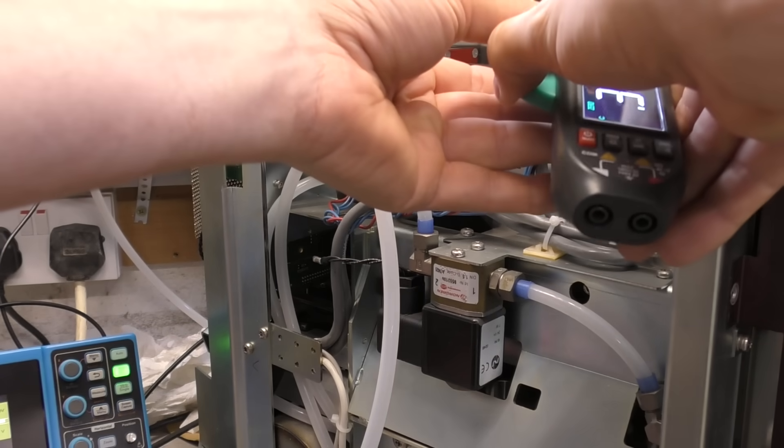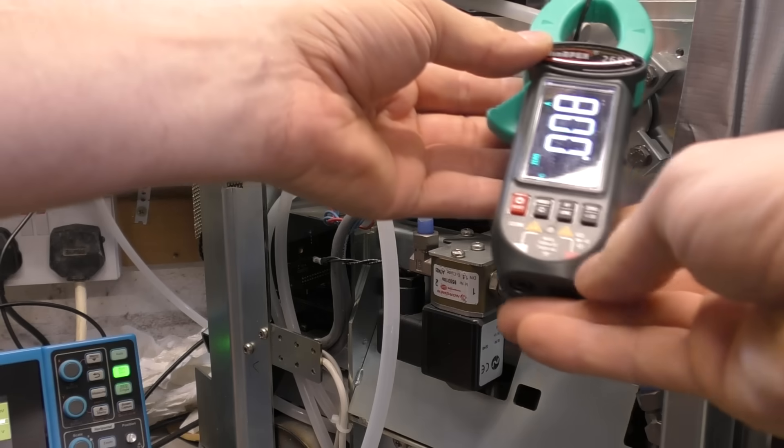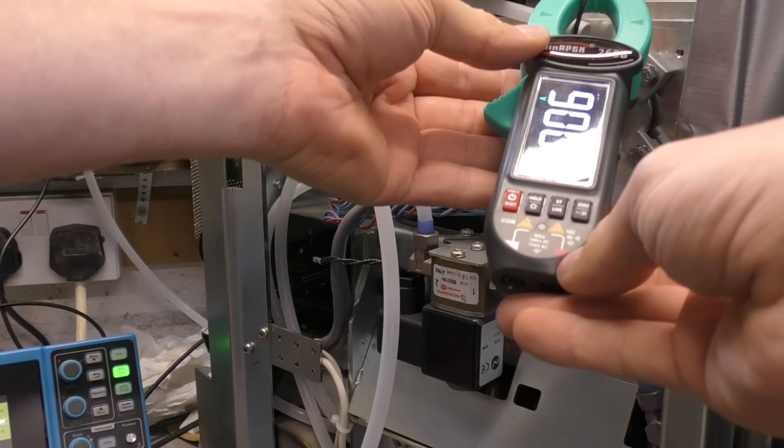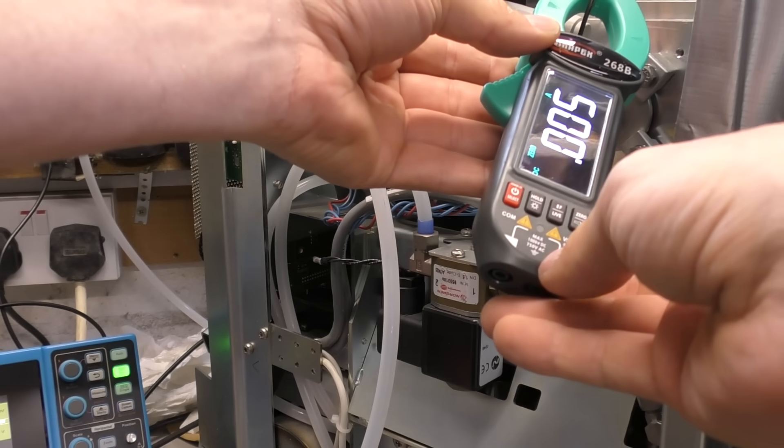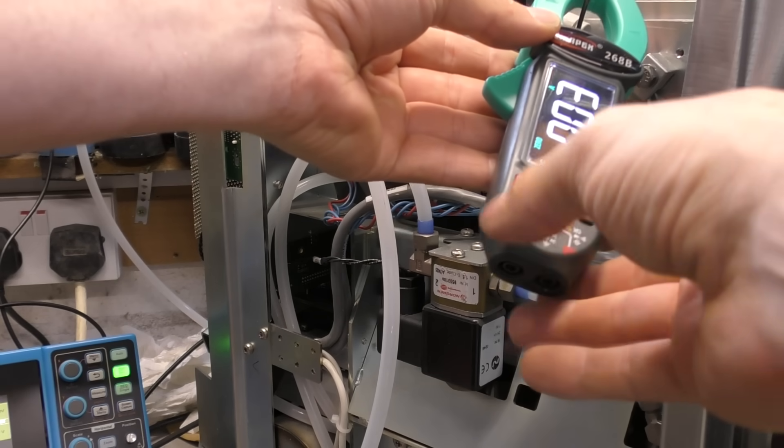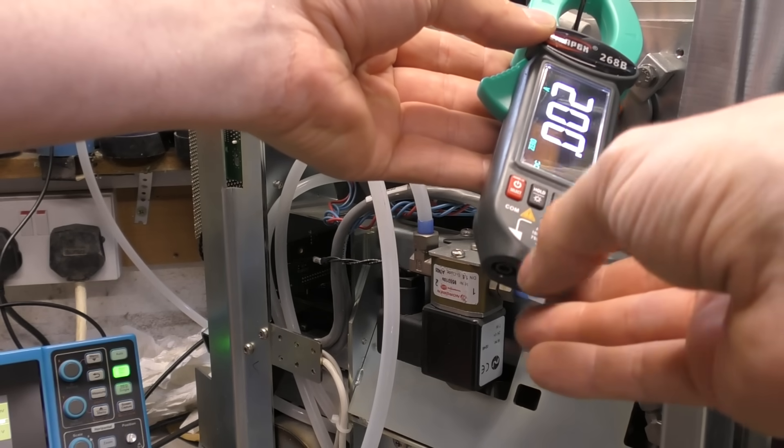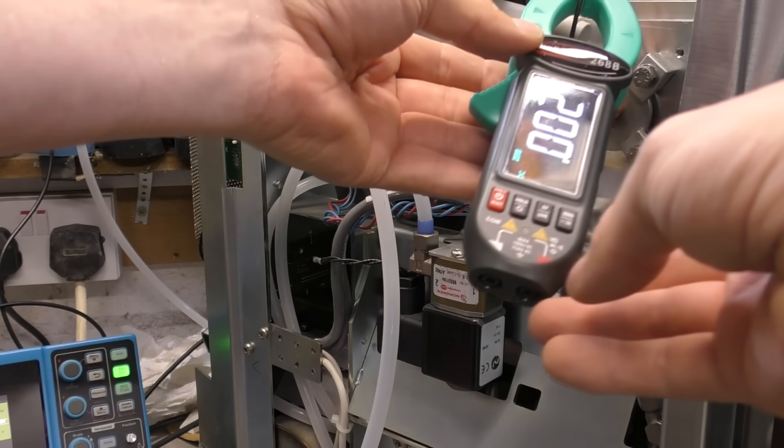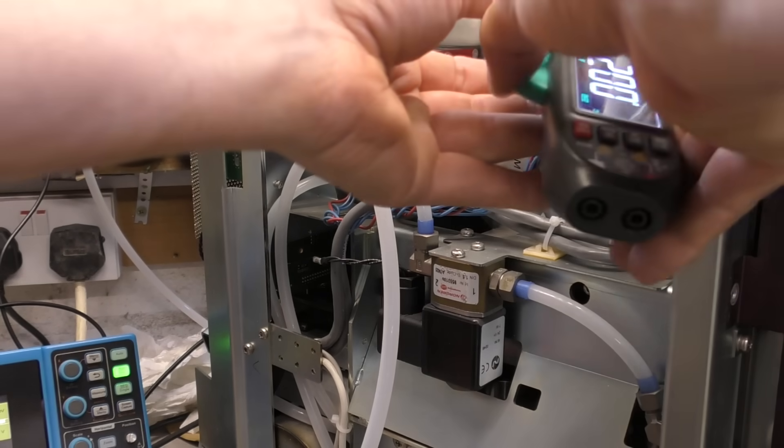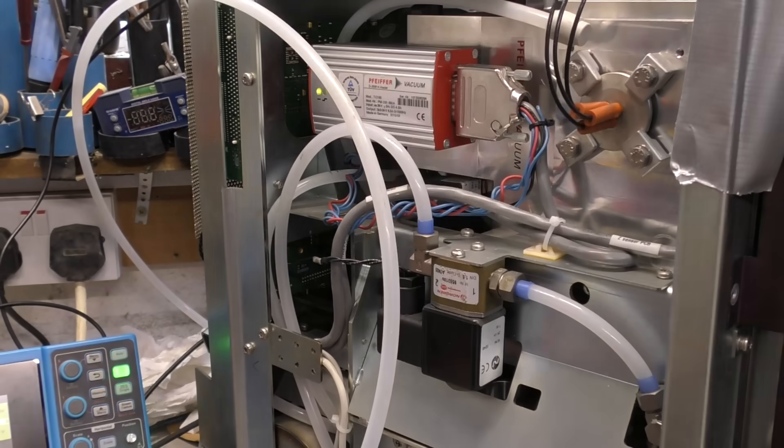Clamp the meter around... bear in mind it's got 5kV on this thing. We've got pretty much nothing, about 5 milliamps, and I think that's just random stray fields. It's pretty much nothing. So it does look like the filament's open.